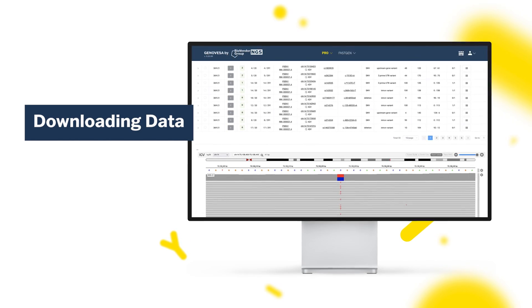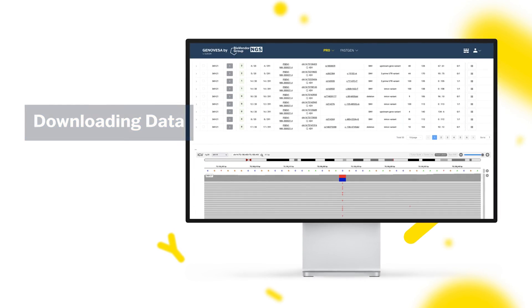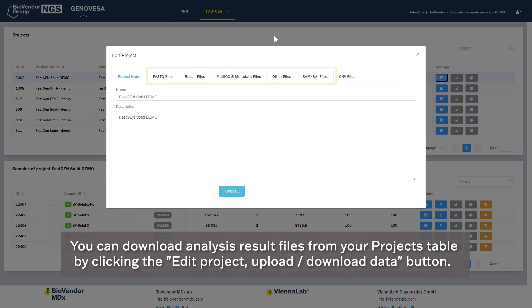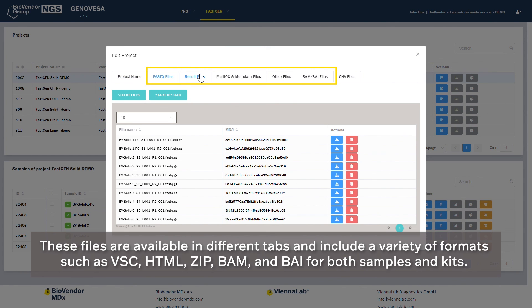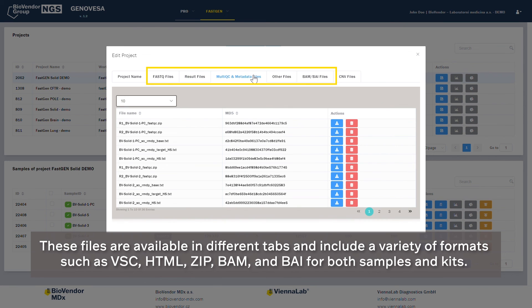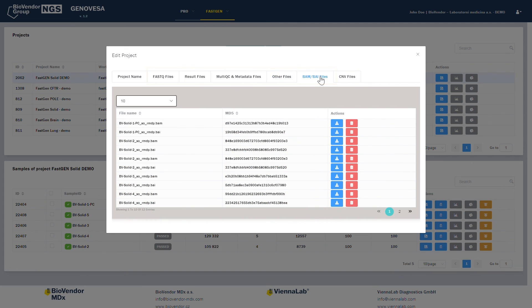Downloading Data. You can download analysis result files from your projects table by clicking the Edit Project Upload Download Data button. These files are available in different tabs and include a variety of formats such as VCF, HTML, ZIP, BAM, and BAI, for both samples and kits.